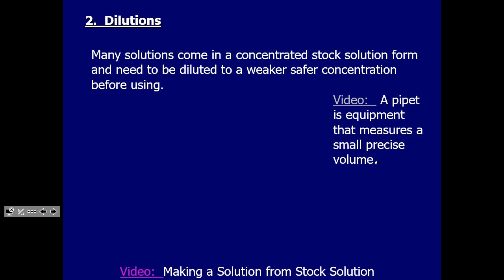Anyway, they don't sell me hydrogen chloride gas, let's say, because I'd probably kill everybody in the building. So what they sell me is a container of concentrated hydrochloric acid, like 36%. It's about 12 molar, right? So all of our calculations we've been dealing with are like 0.5. Like the lab that we're going to do tomorrow with the grade 9s, I'm having them use 1 molar. Yeah, that's concentrated enough. The strongest I've ever used in a laboratory with students is 6 molar.